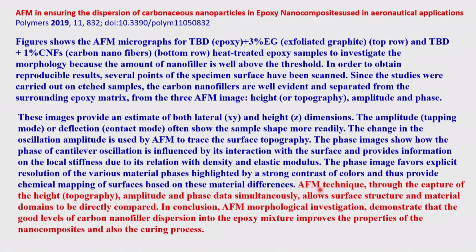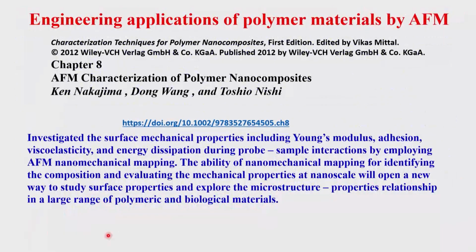So in this, the AFM technique captures the height in the first one, the amplitude in the middle one, and the phase data in the last one, which allows the surface structure and the material domains to be directly compared. So in conclusion, AFM morphological investigation demonstrates that good dispersion of carbon nanofiller into the epoxy mixture improves the properties of the nanocomposite and also the curing process.